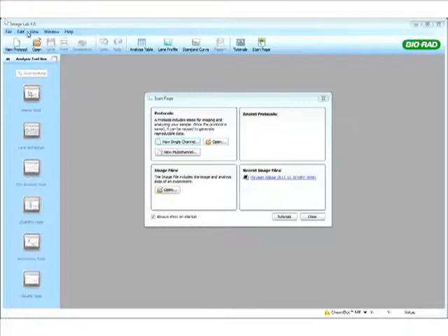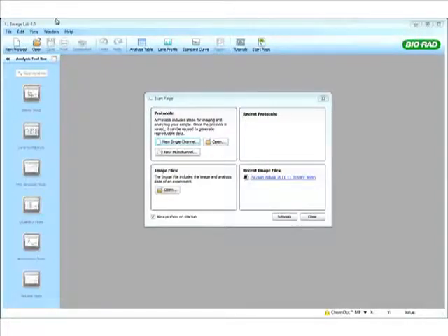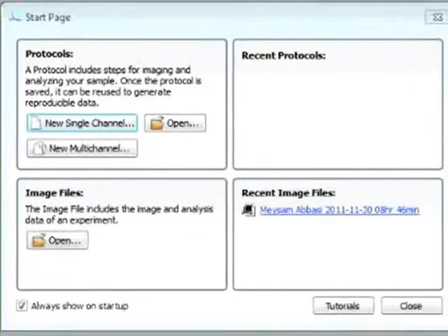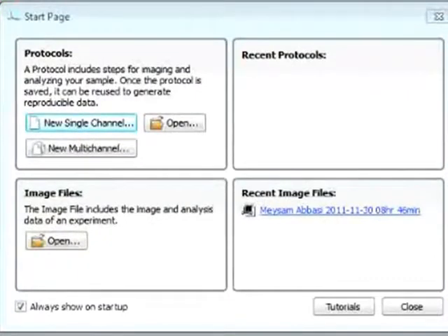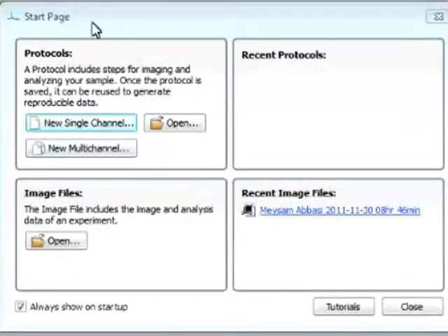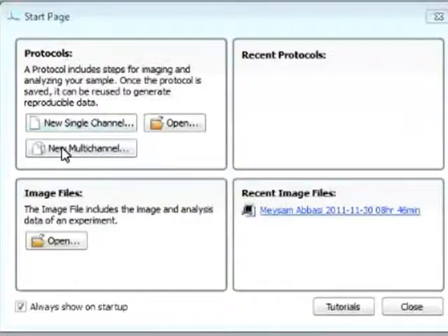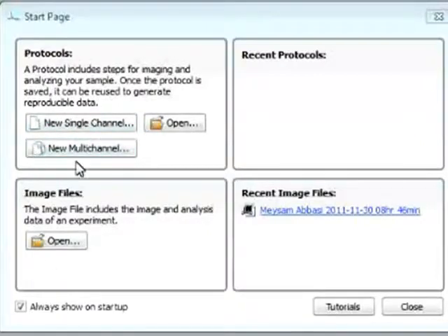The software that is used to run our Chemidoc-MP system is ImageLab 4.0. When we open the software, we get this really nice startup page that guides you through a new protocol or basically opening a file for data analysis.